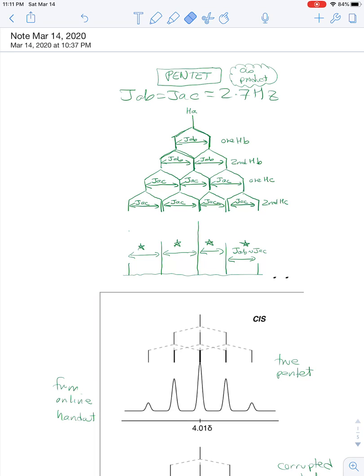Now that we have the coupling constant values that we determined in the previous video, we're going to use those to turn the process around and create a splitting tree.